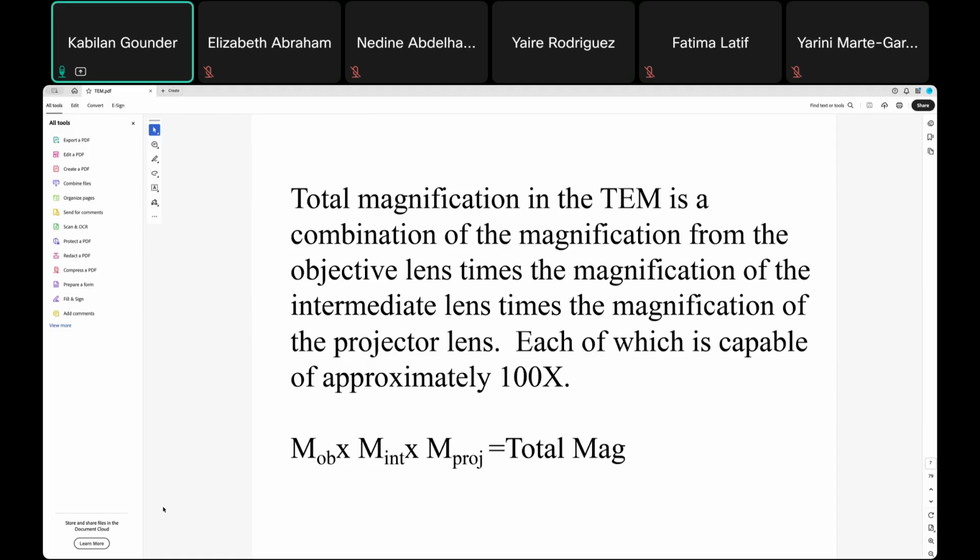That way we can tell that, due to malignancies or infections or any other problem, the size of that organelle is reduced. So you have to convey that to see the structure of that organelle, and you increased more than for the healthy one. These kinds of examples are why I'm telling you that you need to know the magnification.